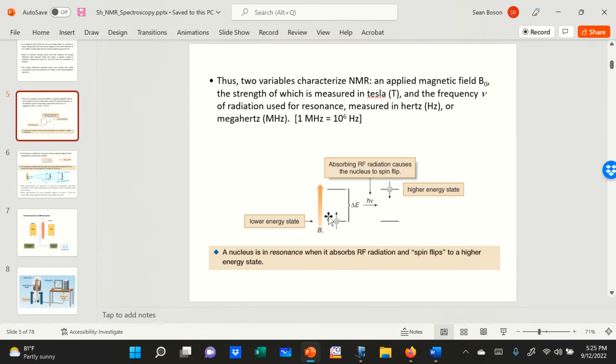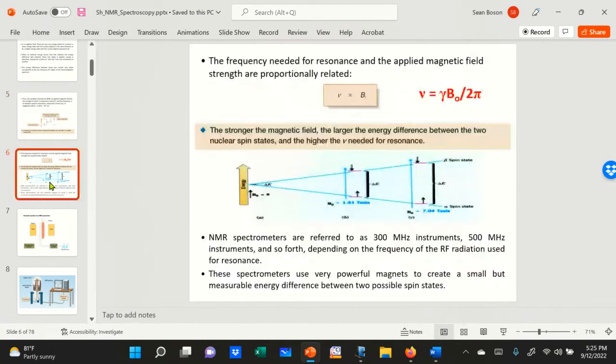So here it shows the spin of a nucleus being along the field, and this one is called the alpha state, by the way. I can also show it in a separate diagram, or maybe this will occur. I'll come back to the previous one. This one doesn't make it clear.